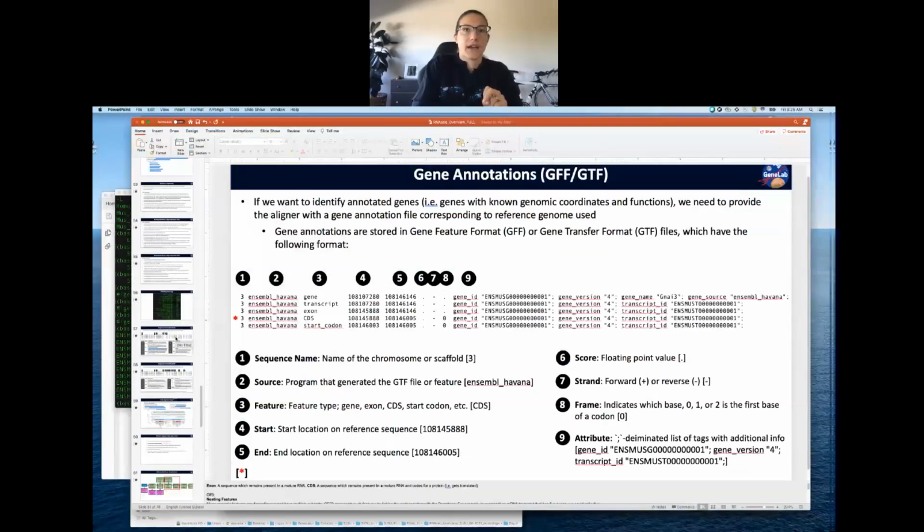You know which file? Any guesses before I bring you the answer? How would we find out the length of the fragment? So the length from the beginning of read 1 till the end of read 2 for all read pairs that align, big hint there, to that transcript.